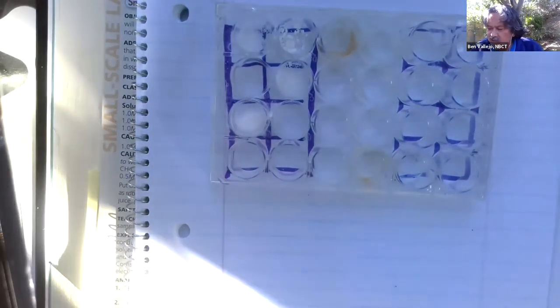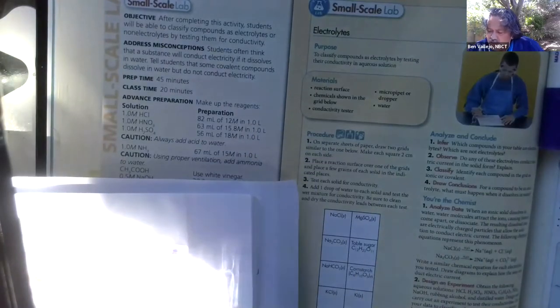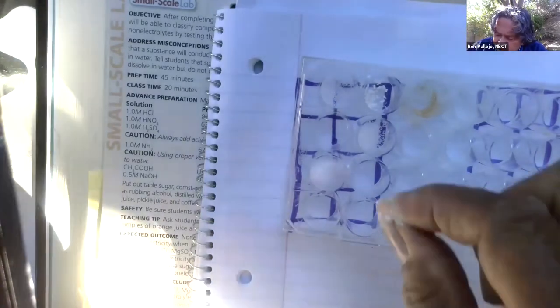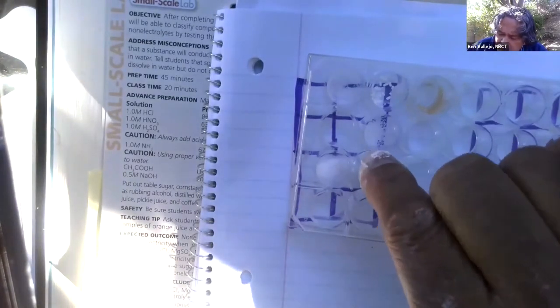Did I do sucrose yet? I think I did, right? Sucrose, cornstarch in second one, second row, third down. So here's a little bit of cornstarch / flour. I'm not sure, but it'll work. That's too much.